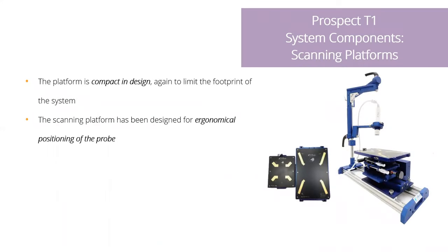The platform itself is quite compact, as you can see here. It is designed for ergonomic positioning of the probe. There are different levers that are released to allow you to rotate the probe on any angle to be able to get the images that you require.